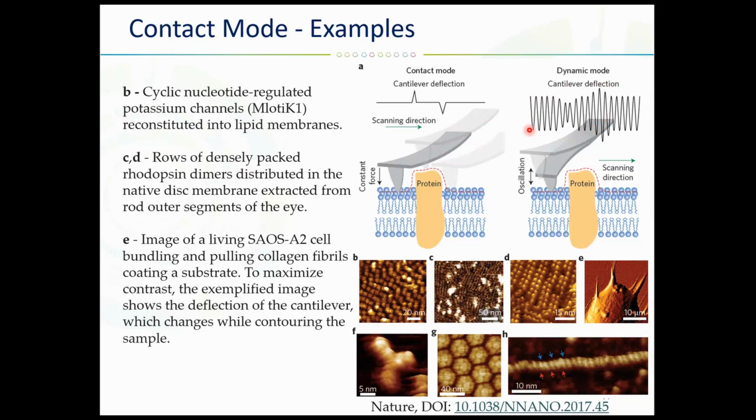So on this picture, what you can see, here we were checking the proteins, transmembrane proteins, and here we have a membrane, and then when we go along the membrane, we have the shift in the height every time when we encounter a protein.